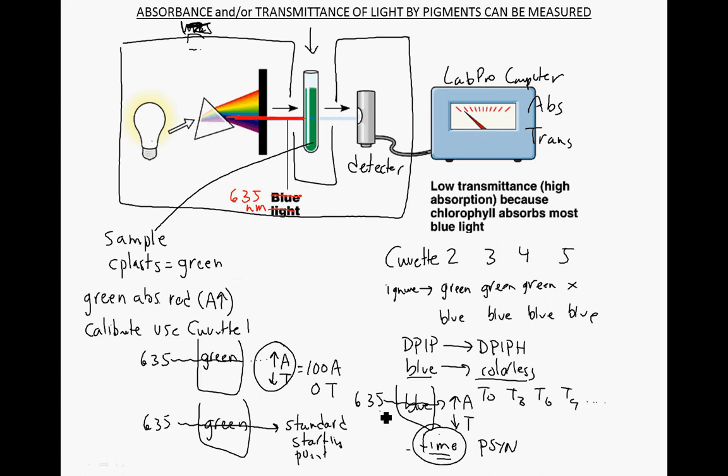And this, of course, is linked to the light-dependent reactions. How fast the light-dependent reactions are happening is how fast photosynthesis is happening. So we're using this dye reduction technique here. That's a little bit more about the colorimeter, how it's working, how the setup is functioning, and what you're going to actually be measuring and calculating in class. I hope that was a little bit more helpful. If not, come to class ready to talk about it and discuss it. Okay, thanks.